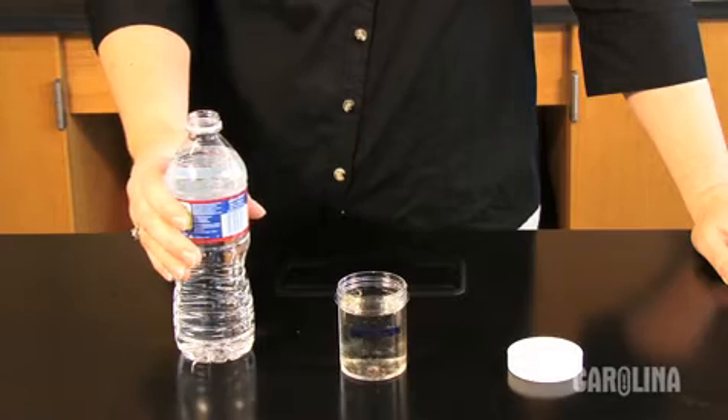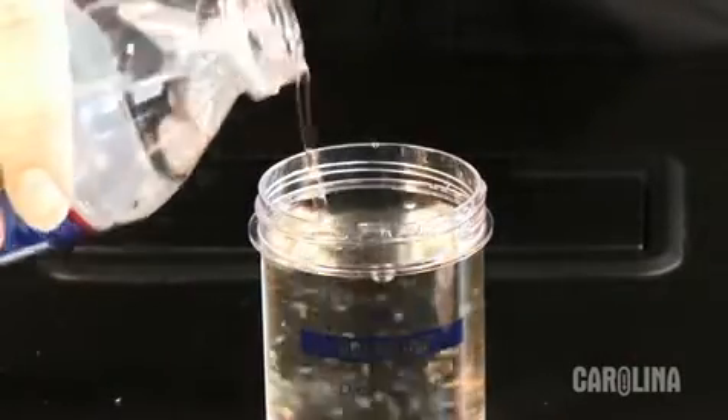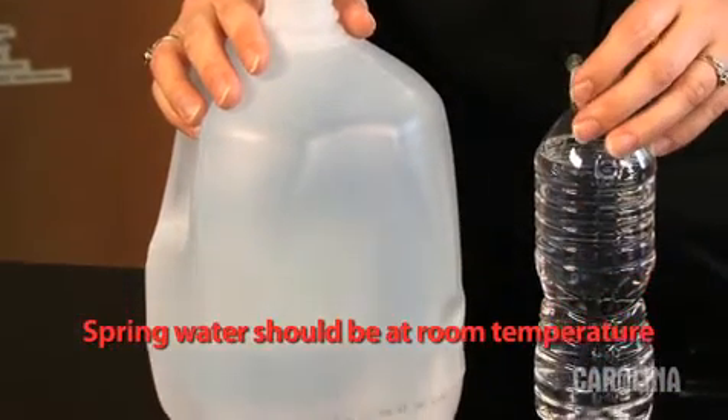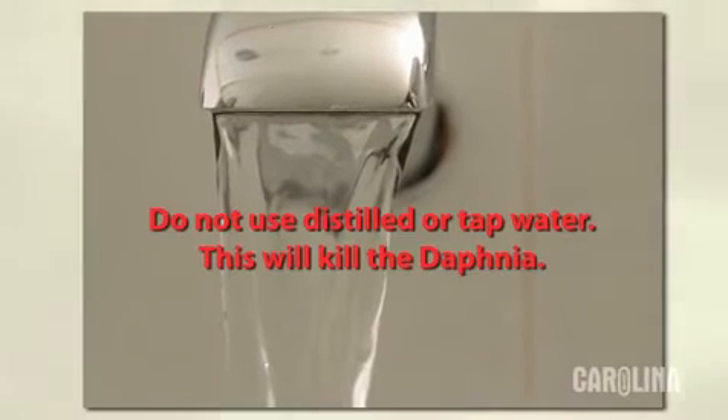If water spills or evaporates from the culture container, you can replace it using bottled spring water. Carolina offers spring water, or visit your local grocery store. Carefully read any label and verify it is from a natural spring water source. Do not use distilled or tap water, as this will kill the Daphnia.